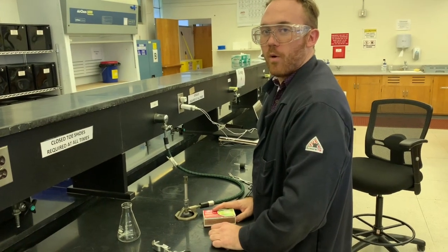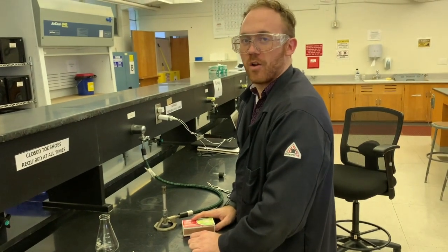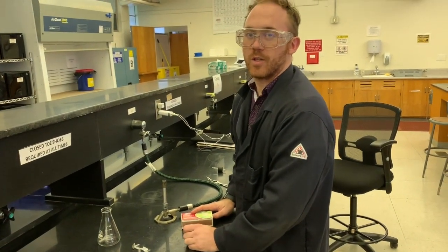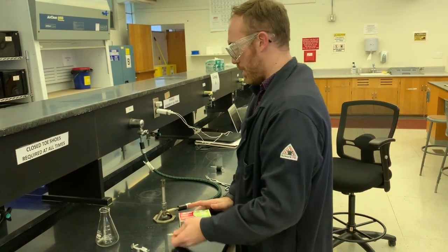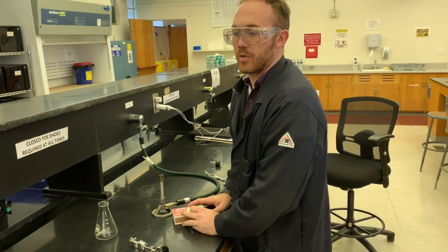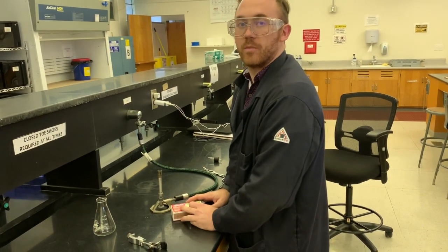Hey everybody, welcome to Lab 7, Charles's Law. We're going to be exploring the relationship between volume and temperature, and the way that that works with, let's say, a gas that we cool down from a hot temperature to a lower temperature and observe a volume change.